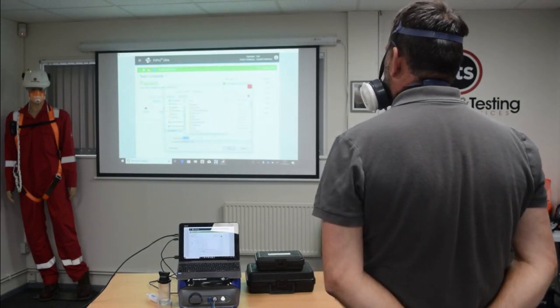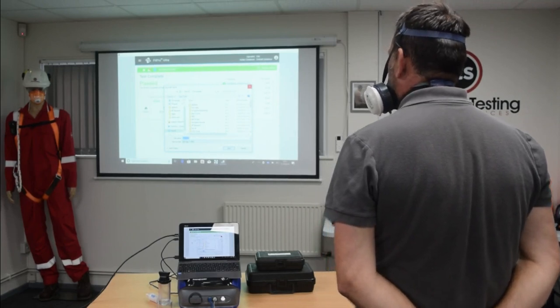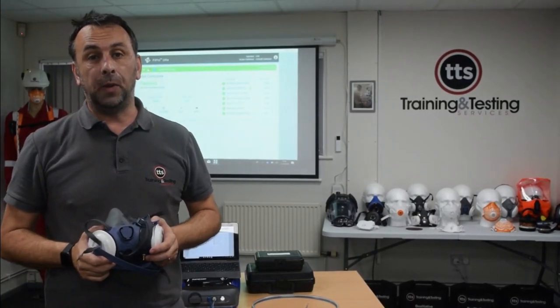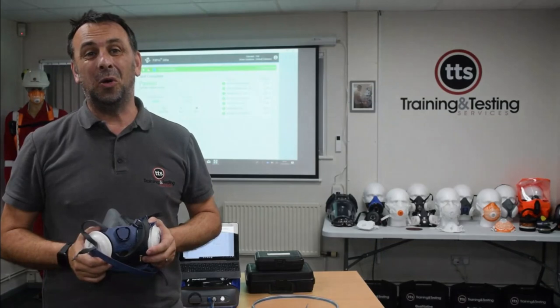We've got an overall fit factor of 4,946, and the pass mark again is 100. Guys, as we can clearly see, that's a pass as well. Okay, this time really high fit factor, just under 5,000. The pass mark's 100, okay?